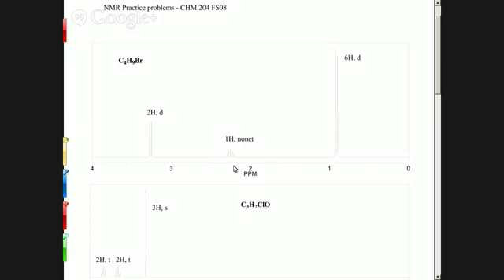Because, okay, you see under CH3 here, and the CH in the middle. So here's the rate. One carbon needs to have one H, but then still have 9 splits, like 8 next to it. This is an important part, because once you get those pieces, you have to decide how you are going to put those together. And these are two legitimate ways of putting it together, but only one is right.